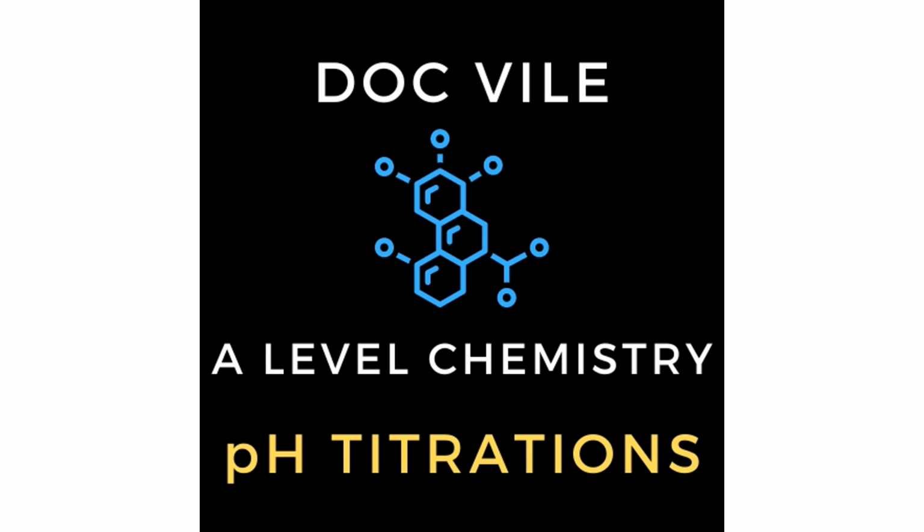This channel is all about getting you ready for your A-Level Chemistry exams, and this video is going to focus on pH titrations. So we're going to be looking at how you can do a titration but without using indicator, but instead using a pH meter. Now it would be a good idea before you come to this video if you're already familiar with how to do a regular titration and titration calculations, although we will recap it as we go through.